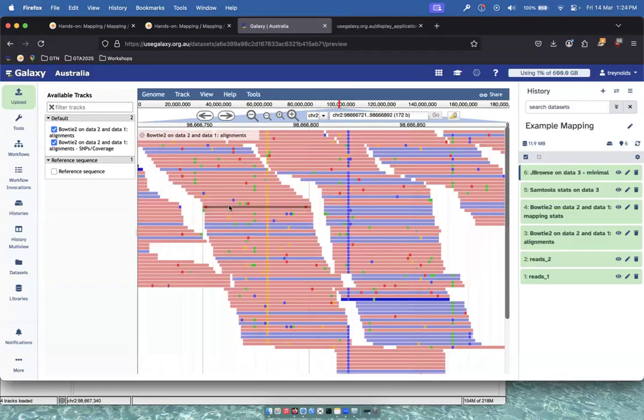And you also note that all of our reads are colored either red or blue, and this indicates whether this is the forward or reverse strand. So red is a forward strand, and blue is a reverse strand. Darker shades is when the forward or reverse strand is missing its corresponding mate. So in the case of the dark blue, that is a reverse strand, which is missing its matching forward strand, and dark red would be a forward strand, which is missing a matching reverse strand.